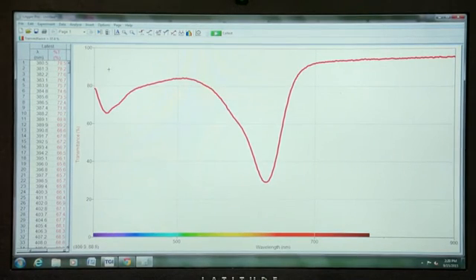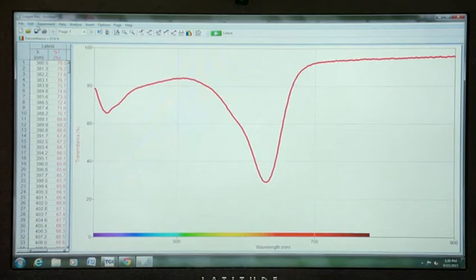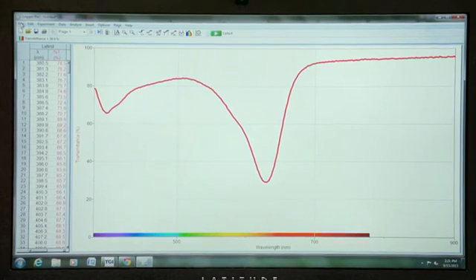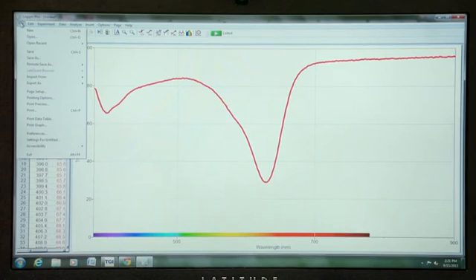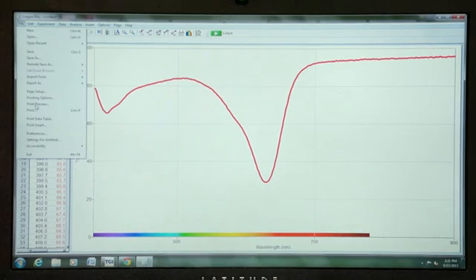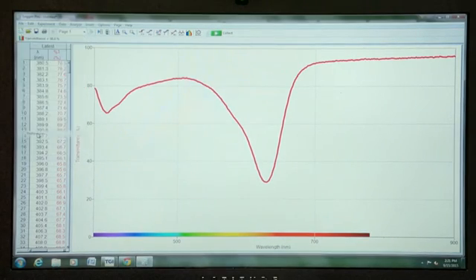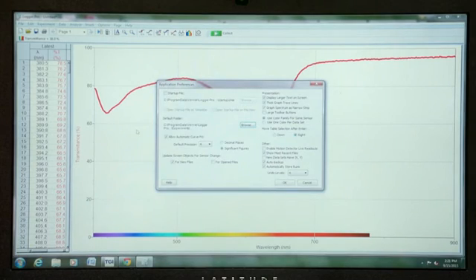In order to change that so that it becomes a full set of readings and colors the entire graph, we will go to the file menu and choose Preferences.